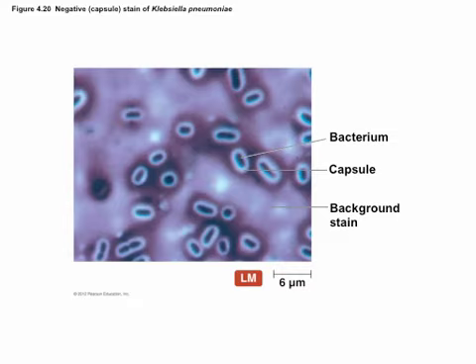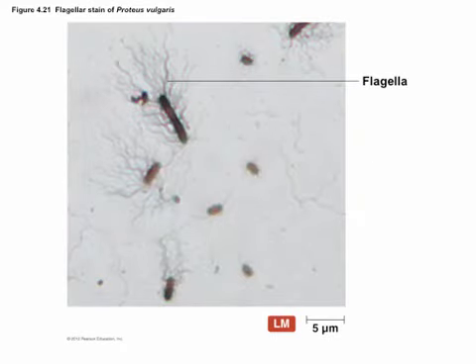So this is a flagellar stain. Another special stain that you would see in some circumstances. Is this simple or differential? Simple. One color. With this, you're using specific special dyes that stick to flagellar proteins. And you can see all the flagella coming off of that cell. It's kind of nifty. When you look at cells most of the time, do they look like that? No. Usually you can't see the flagella. The flagella is not innately charged. Basic dyes don't stick to it. Acidic dyes don't stick to it very well either. You have to use a special dye that specifically will bond to the flagella in order to see it.